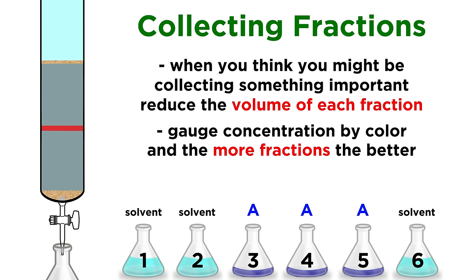Combine all the winning fractions in a flask suitable for a rotavap, evaporate the solvent away, and there you have your product, purified and isolated. Now you're ready to get an NMR spectrum, and know for sure if your reaction went as planned.